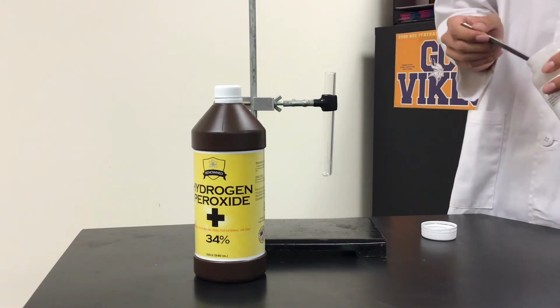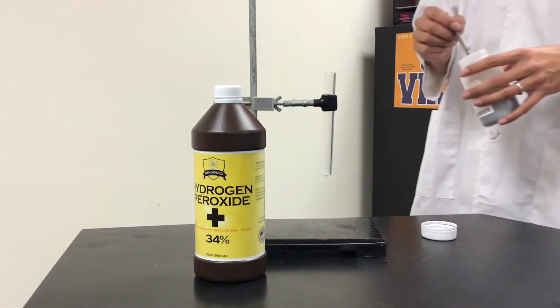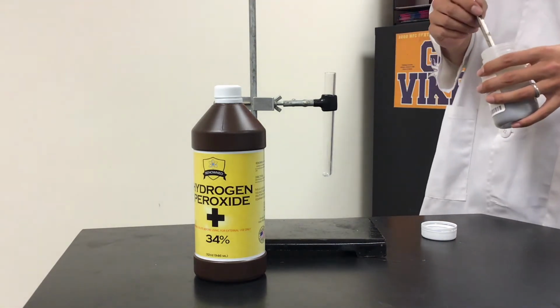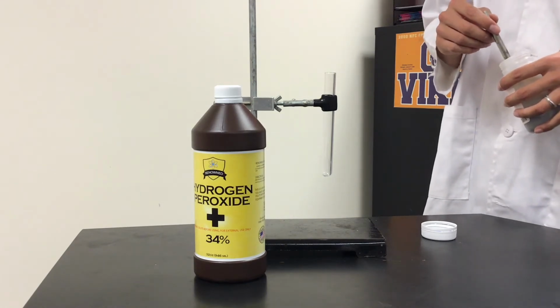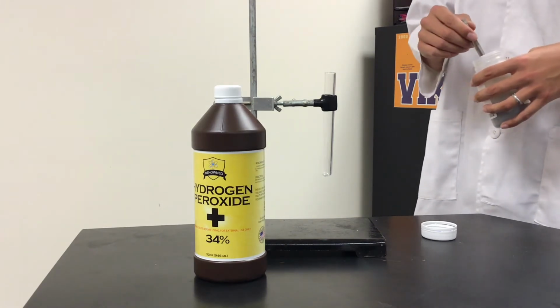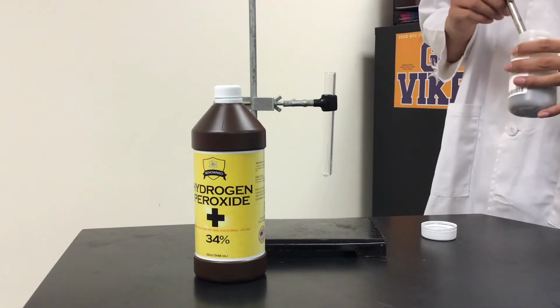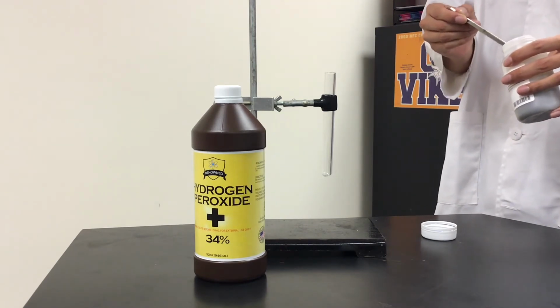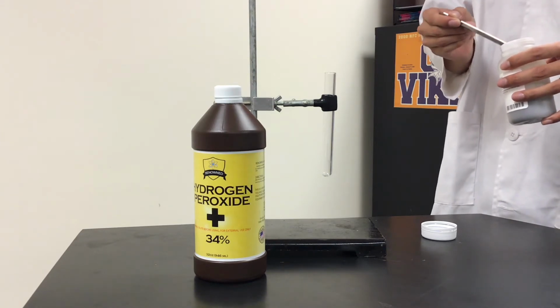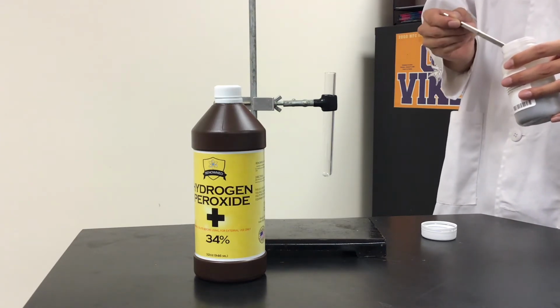So what we normally can do is put the solid manganese dioxide into the test tube, measure it first, then put it in a test tube, then after the reaction take it out and measure the mass. Before and after the reaction, the manganese dioxide should remain the same, but since this is a powder form, it's actually hard to tell the mass. So right now I'm just going to show you the reaction.